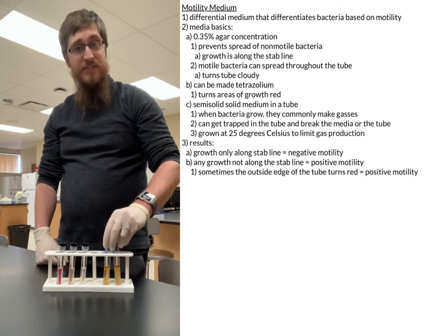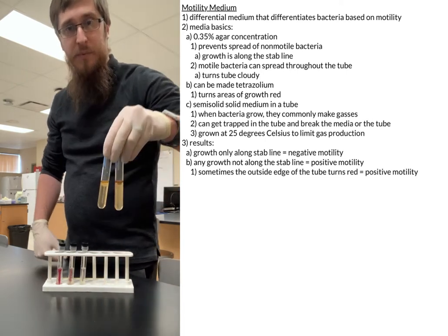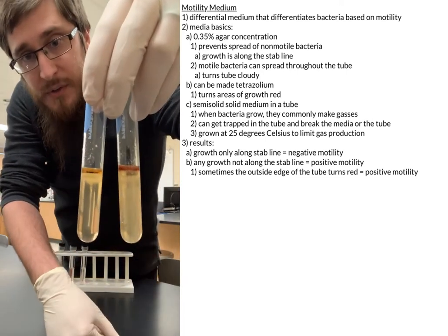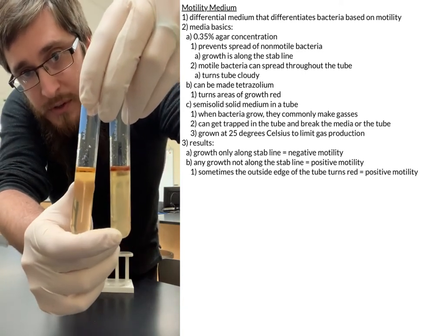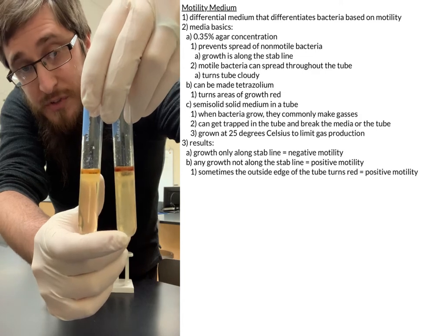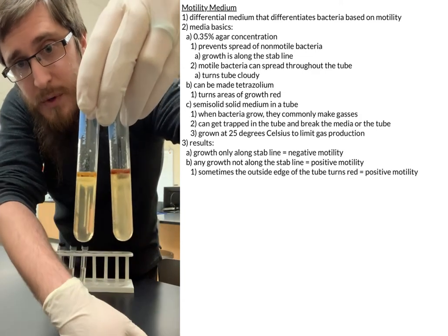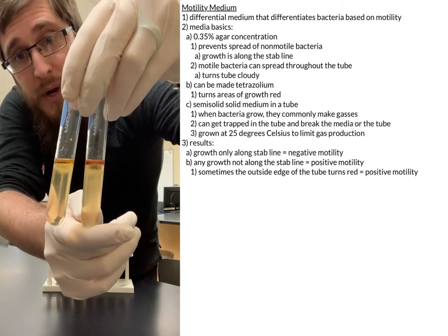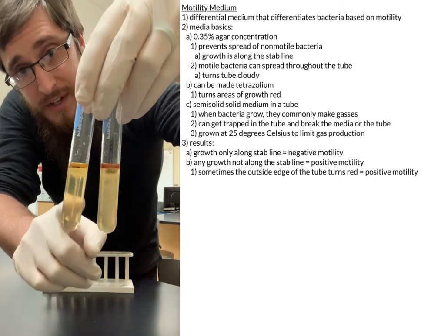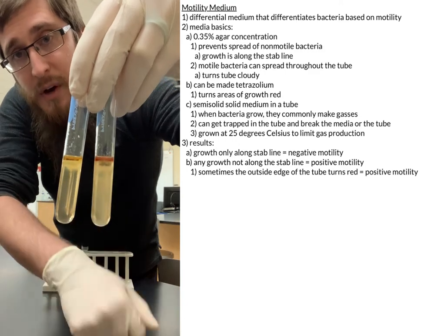But I have an example here of some that do not have it, so we can look at what that looks like too. So in this one here, you can see, again, just nice growth down along the stab line here, but most of the tube is fairly transparent. You can see through it very well. Whereas on this one here, it's very cloudy all the way throughout. So again, this one is negative for motility. This one is going to be positive for motility.